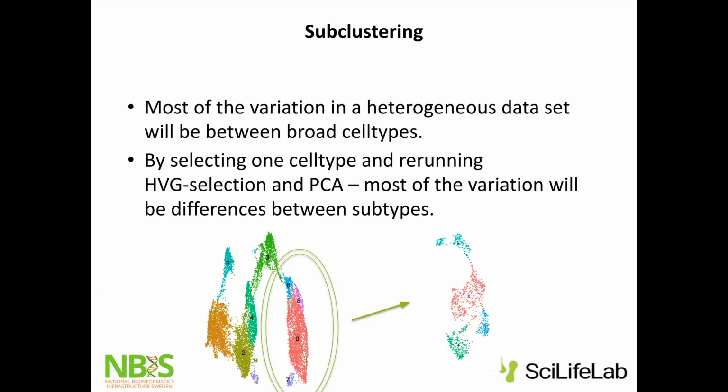Related to this, when you want to validate your clusters, do you look at the genes driving those clusters, or do you do one extra step of differential expression analysis? From this graph clustering, we can't really find the genes that are driving the clustering per se. That kind of information is lost in the whole method. So to find what's driving the clustering, we need to go into differential expression.